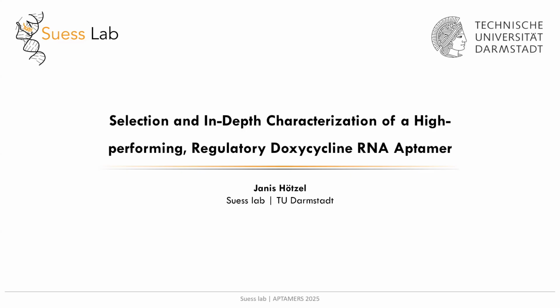Thanks for the introduction. Today I'm going to talk about a project that we started in the lab where we accidentally found a highly potent regulatory doxycycline RNA aptamer, where we actually just wanted to compare SELEX methods, which is quite funny.